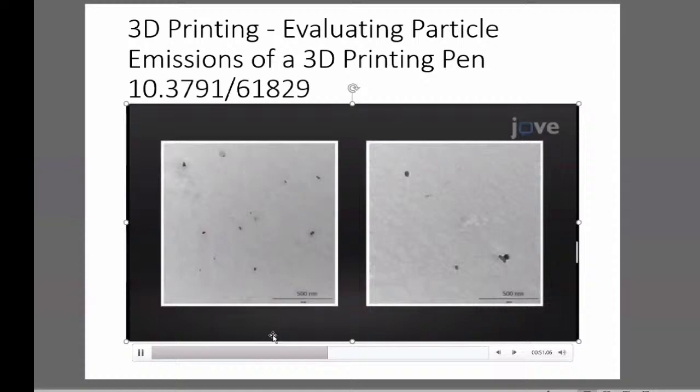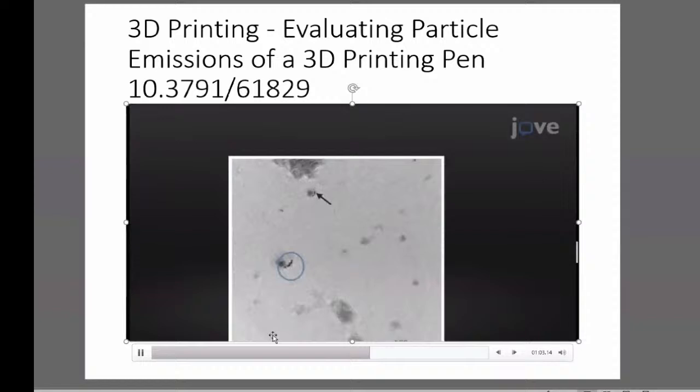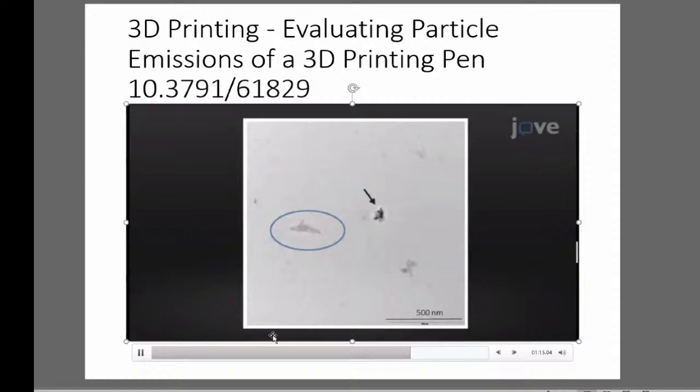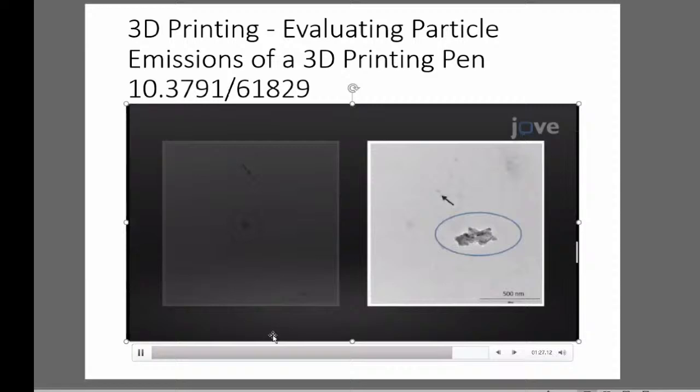Transmission electron microscopy imaging shows particle sizes mostly around 50 nanometers for PLA, and almost consistently larger particles up to 100 nanometers for ABS black. PLA copper filaments contain copper, mostly in crystalline form, as well as PLA particles. In this image, a released carbon nanotube from a PLA carbon nanotube filament is possibly observed. The release of small steel particles during the printing with a PLA steel filament and a possible agglomeration of silver aluminum flakes during printing with PLA compound with an incredibly high silver aluminum flakes amount may also be observed.